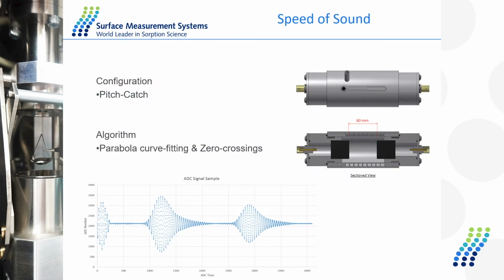A speed of sound sensor measures the time of flight of a carrier gas plus solvent combination and measures the density of that gas, basically, and it relates back to the relative humidity or partial pressure of that specific solvent. We have to build up an entire library of solvent plus carrier gas combinations to accurately measure the concentration of gases during our generation.